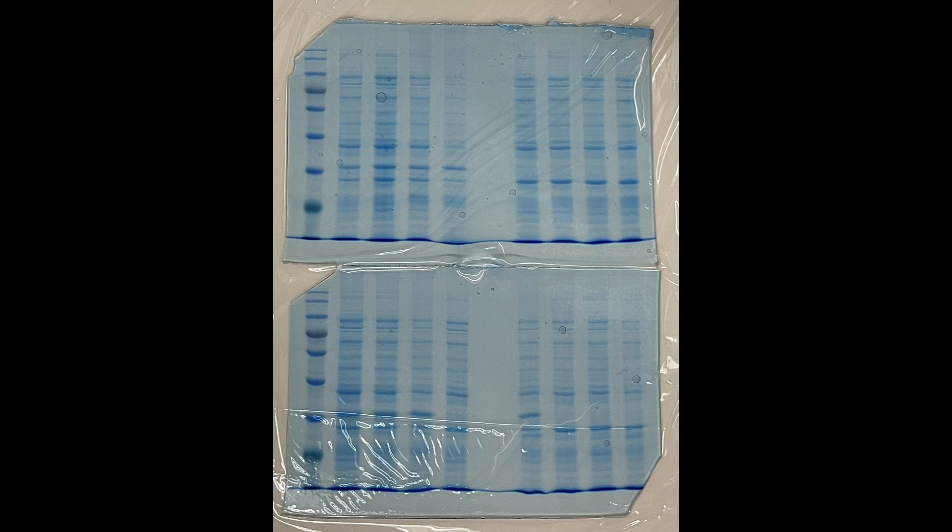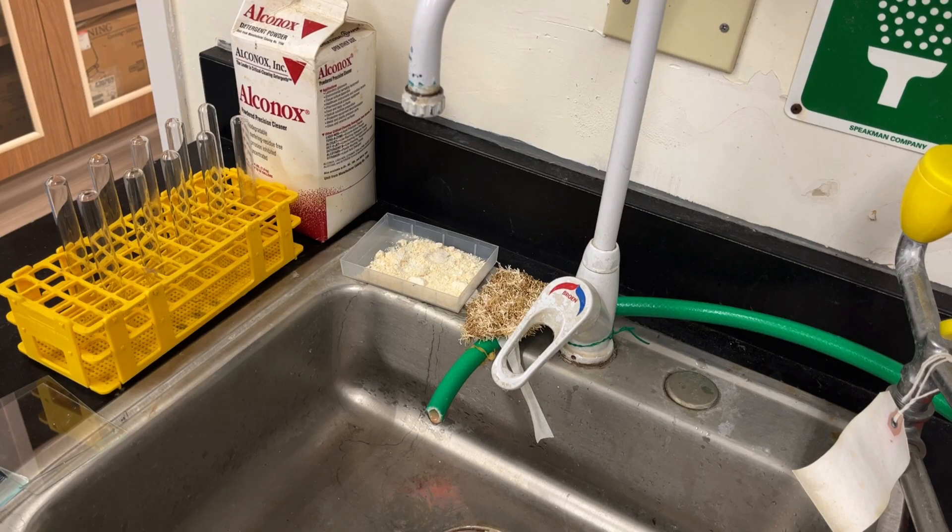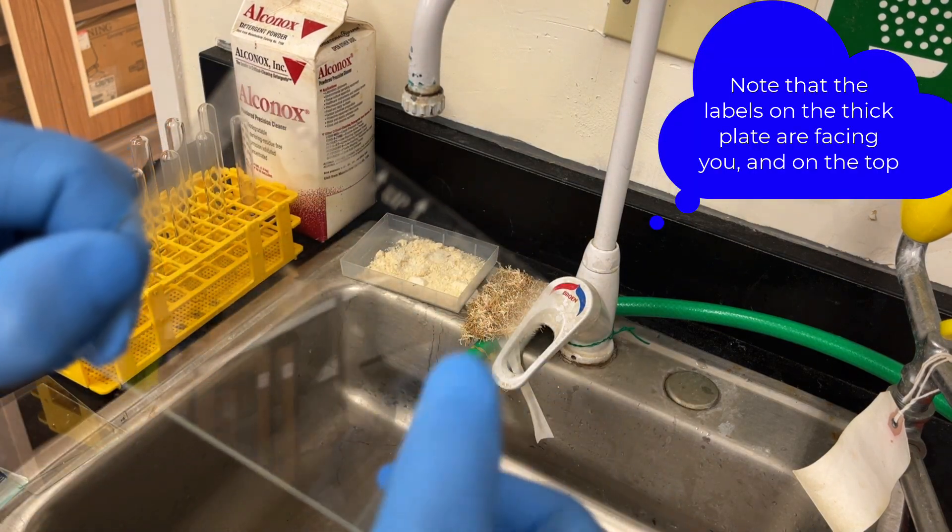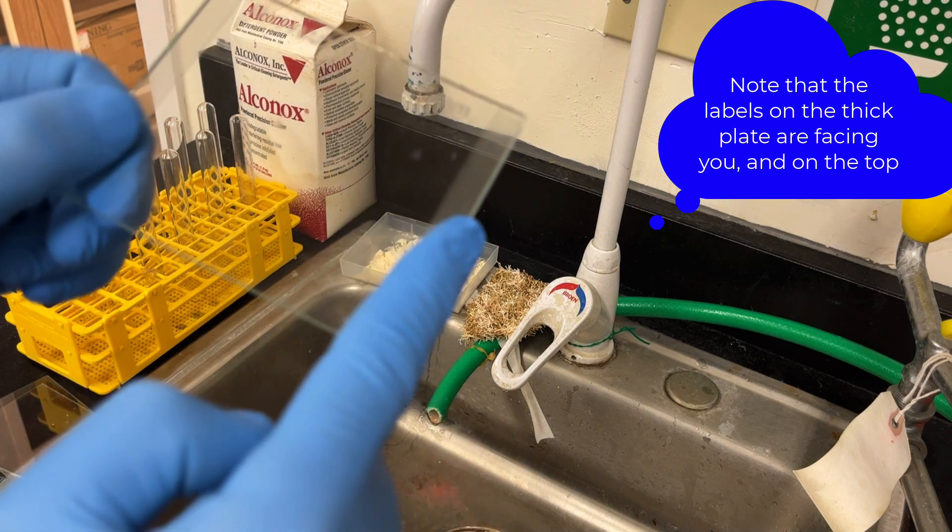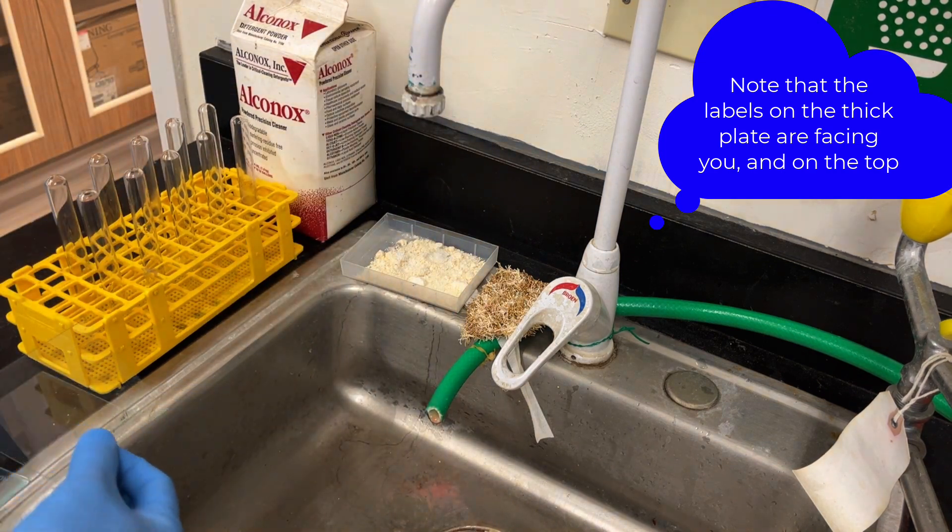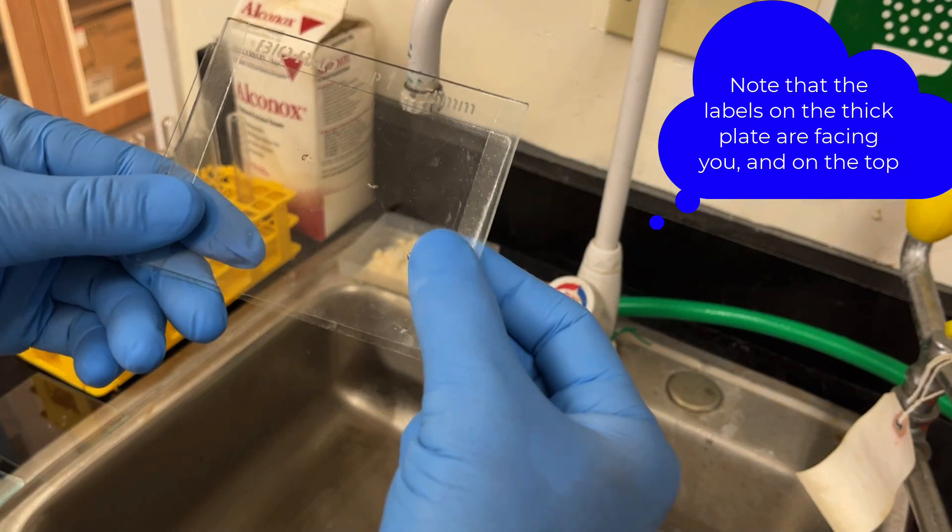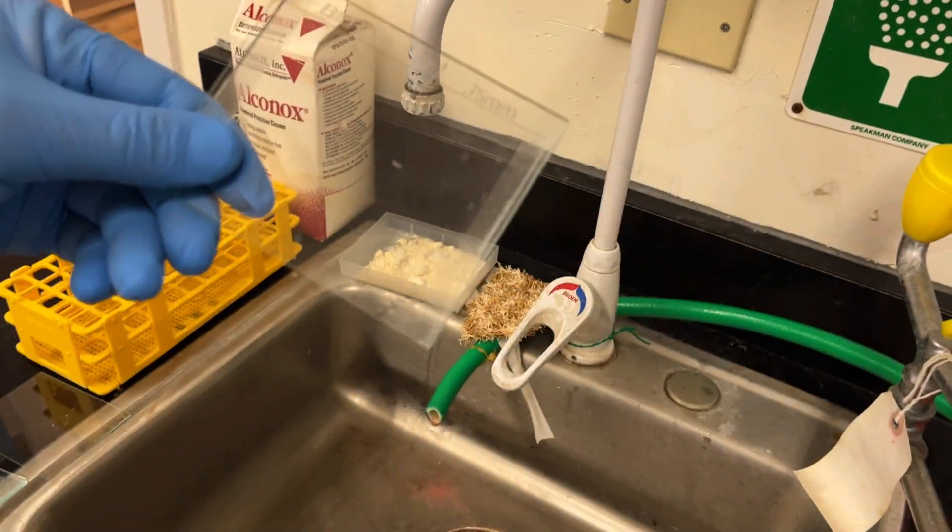An important difference between agarose gels and SDS-PAGE gels is that we pour an SDS-PAGE gel in between two glass plates. So it's important that they're very clean. We've got a thick plate with these little ridges and then a shorter plate, a little bit smaller, that sits on top of that little ridge. Cleanliness is very important; any small sticky bits will cause your gels to stick.